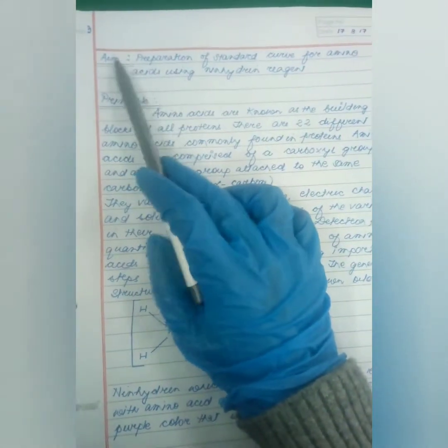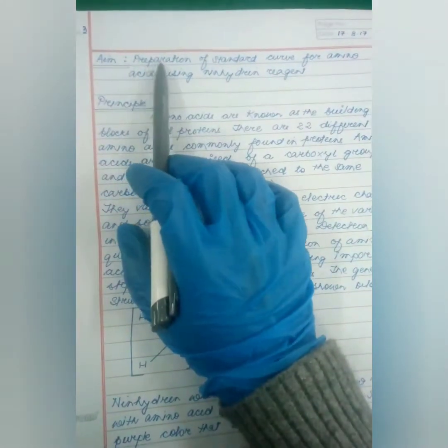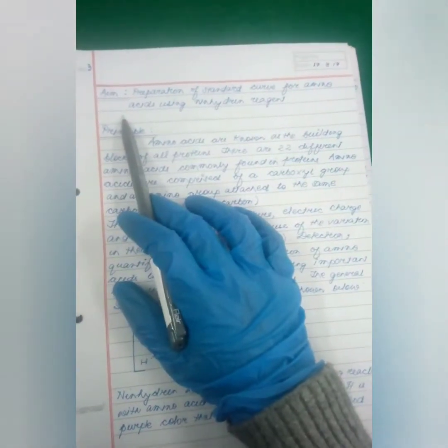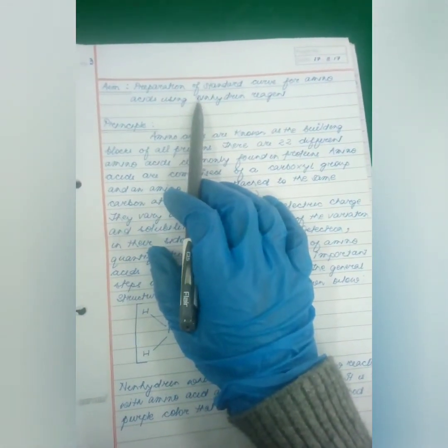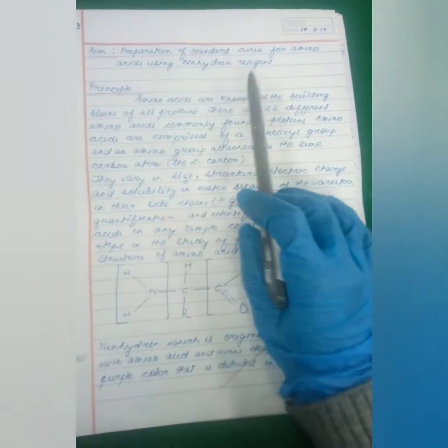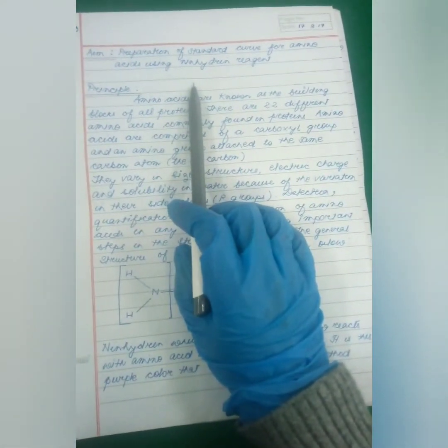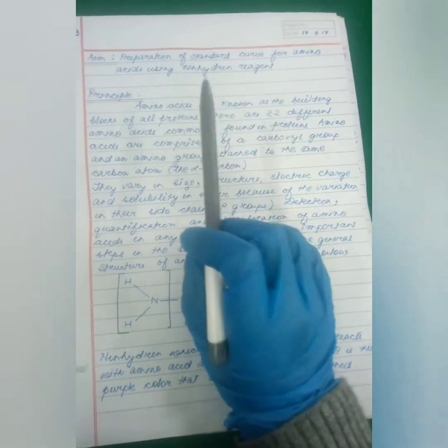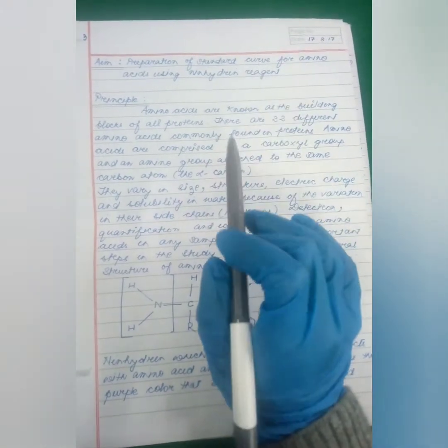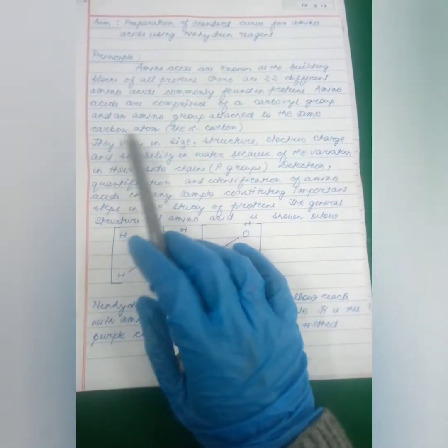Girls, today in this video I will explain a little bit on this experiment, the preparation of the standard curve for amino acids using Ninhydrin. This amino acid I had already discussed with you in the theory. If you remember, there are 22 different standard amino acids which are commonly found in proteins.